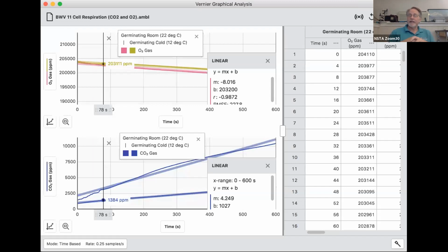What I'd like to do is another one here in a second, and we'll take a look at a different data set. So let me do that. I'm going to switch over to a chemistry one, and in particular, I want to do a titration. Thinking about where we are right now in terms of students being able to collect data themselves, there are certain things they might be able to do at home, but a titration would definitely be one that they couldn't do. So having that titration data would be a good thing there.